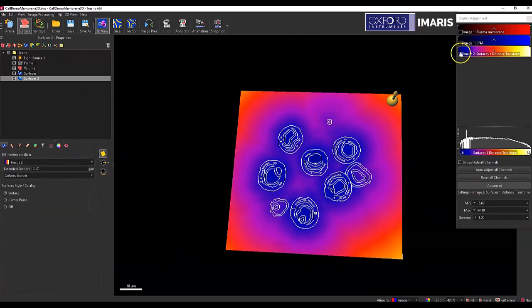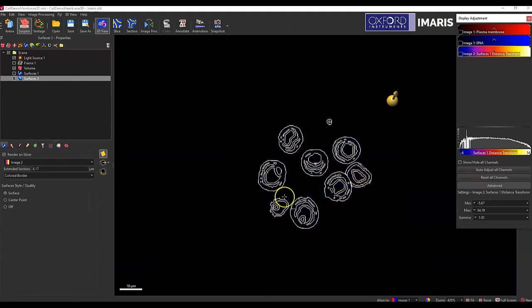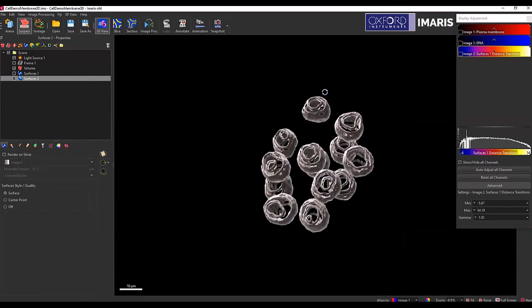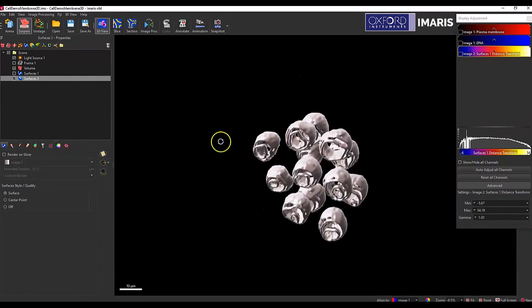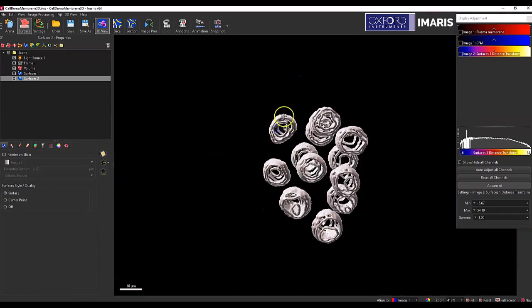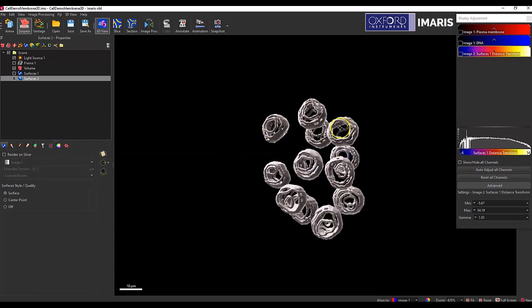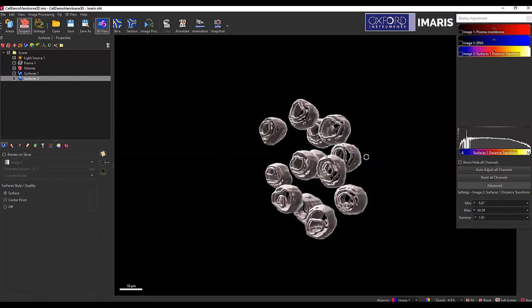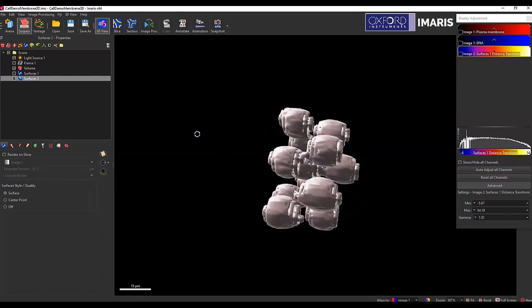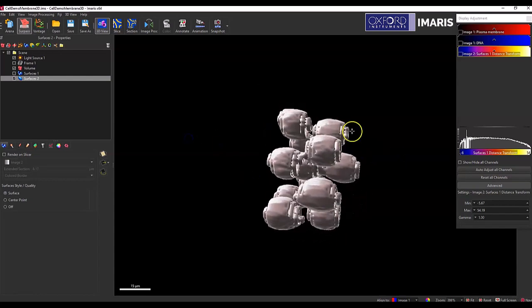Okay, and then we can turn off looking at that volume and then just look at the actual surfaces that were created. And so these will be donut shaped because I did exclude any of the surface creation within the structure. So you can see how that was created there.